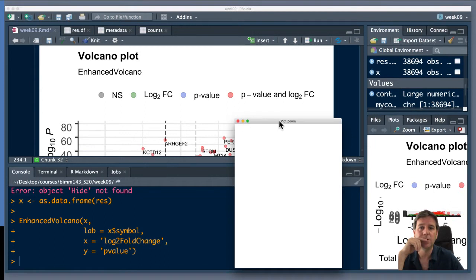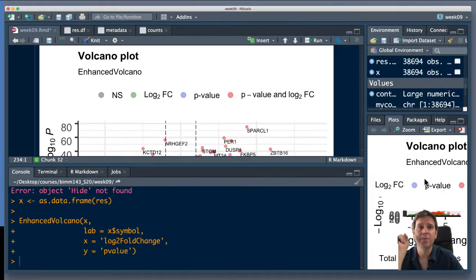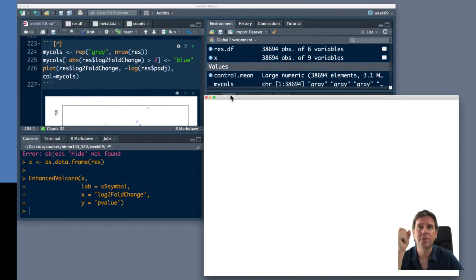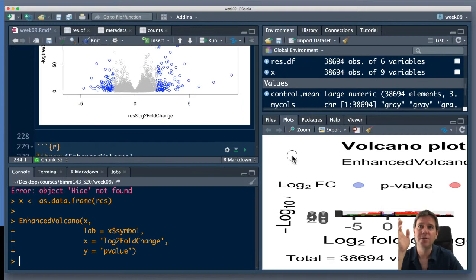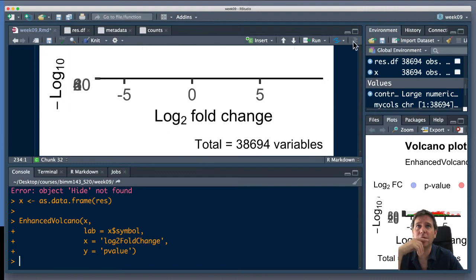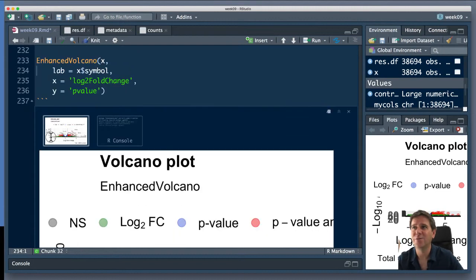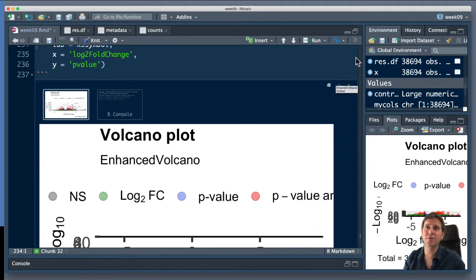Okay, so here's my plot, because I'm messing around with all the figure margins here. Okay, let's not worry about it for now. It's appearing eventually. But this plot, let's make this small again, is telling us that, excuse me, it's gone back to the funny zoom, but it would label up those points.